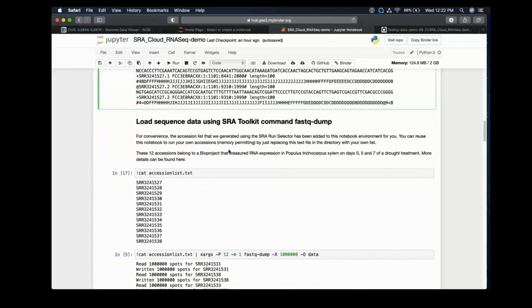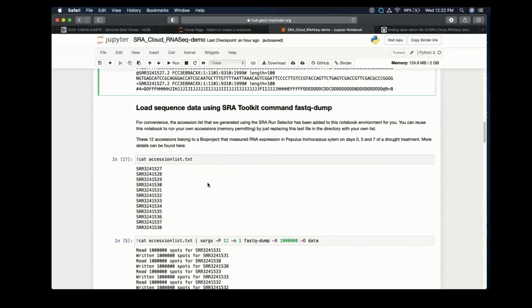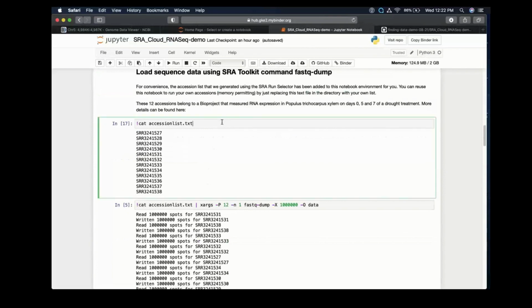All right, but I don't just want 2 lines. I want to actually do an analysis here. So what's my strategy? Well, I'm going to have to do something called batch, which means I send a whole bunch of numbers into the program to run. There are different ways of doing this. I've been doing bash for a long time, so I apologize if you're not familiar with these commands, but there are many ways to do this.